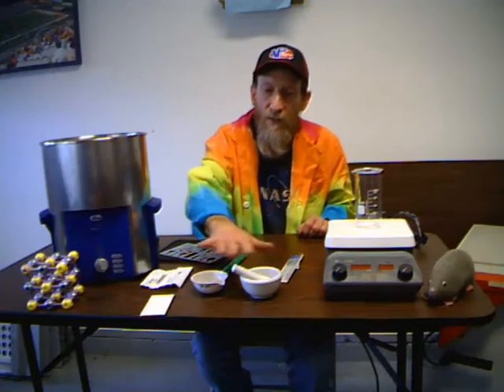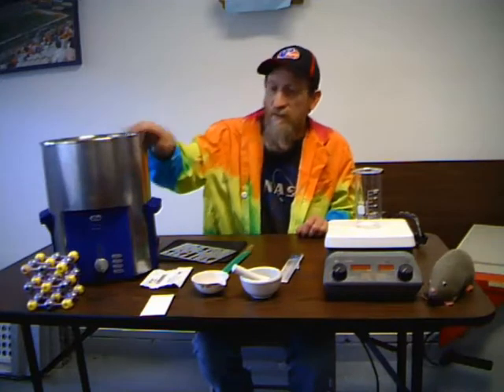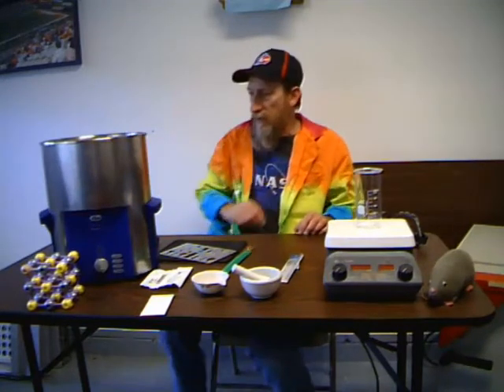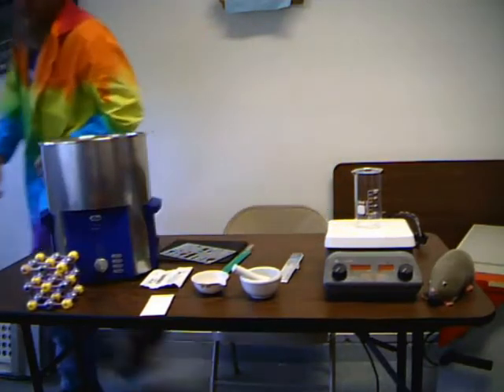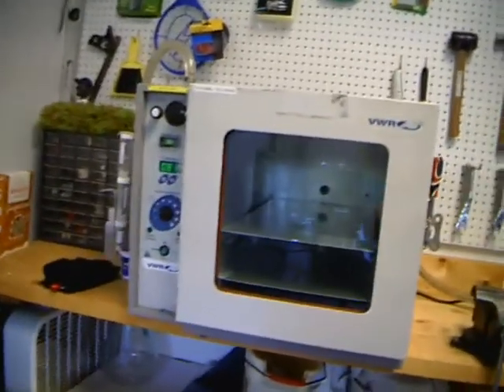Welcome to another episode of Kicked Up Chemistry with Professor Leonard. This is the third video in the three-part series on the introduction to the laboratory and different apparatus and glassware that you may be using in an introductory lab. Today we're going to look at some specialized porcelain glassware, a hot plate with magnetic stirrer, an ultrasonic cleaner, a laboratory convection oven, and a laboratory vacuum oven.